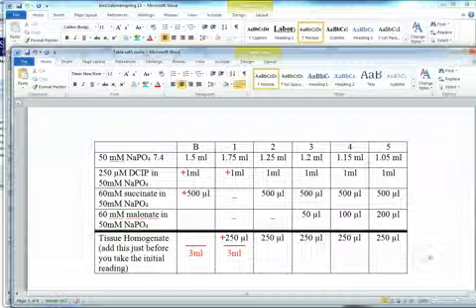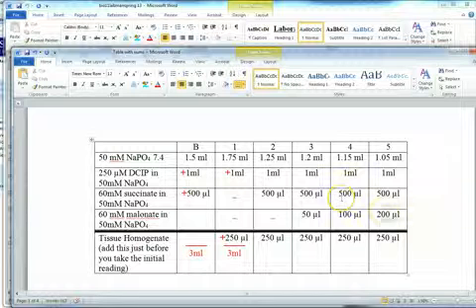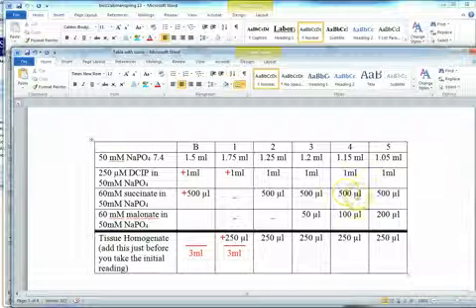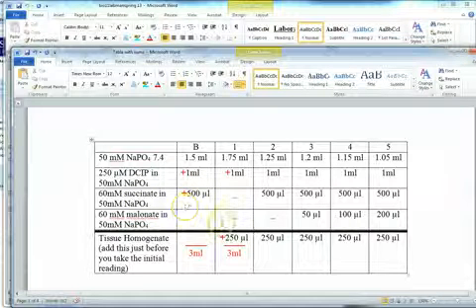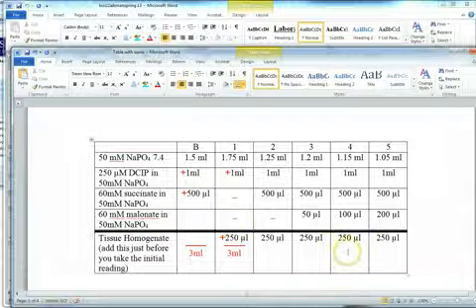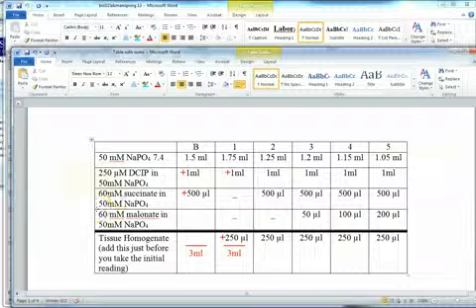The important thing about the concentration of succinate in this reaction was the final concentration, that is 500 microliters of 60 millimolar succinate in a 3 ml reaction. That's 10 millimolar. That's the important thing. Now, as it happens, we had 60 millimolar stock in lab.